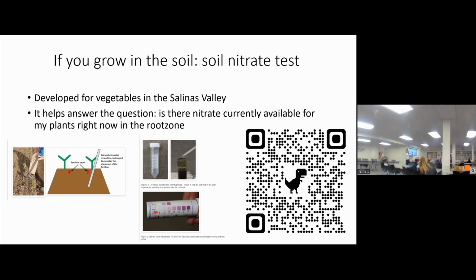So maybe you can go out there with one of these things like this, and you walk around your grove with a bucket, and you push this in the soil. You get one sample, and you put it in the bucket.